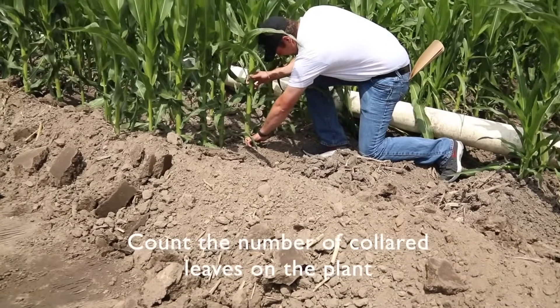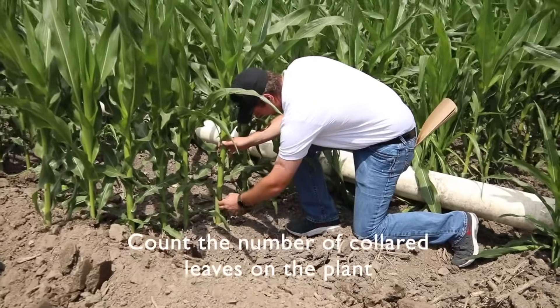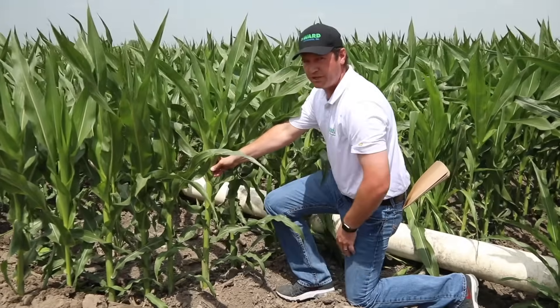Starting down with the brace roots, we count up — probably one, two, three, four, five, six, seven, eight, nine, possibly ten leaf corn here.